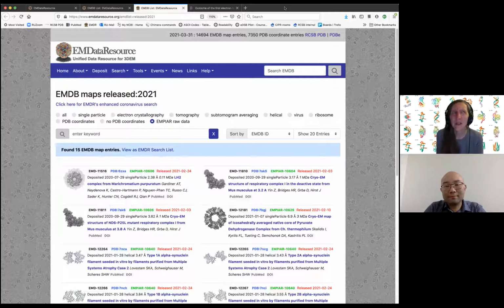Phenix is, I think, not currently being used, but I think it's being considered to replace what's currently being used. But MolProbity, for instance, is used for coordinates. Now, in terms of, what are we using?